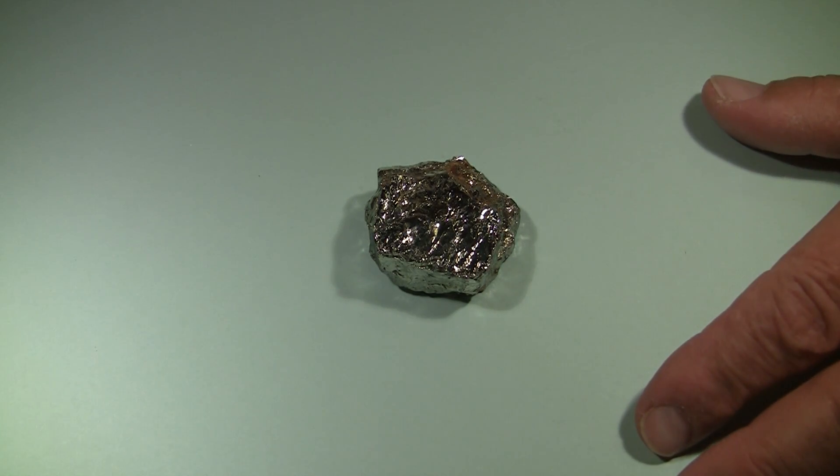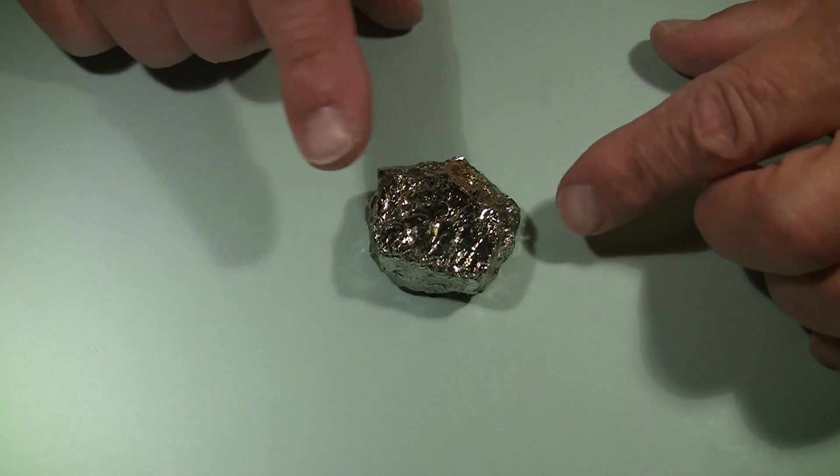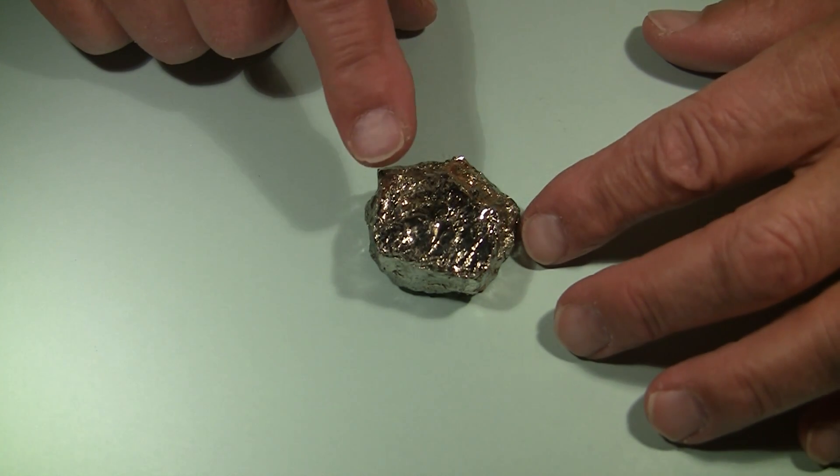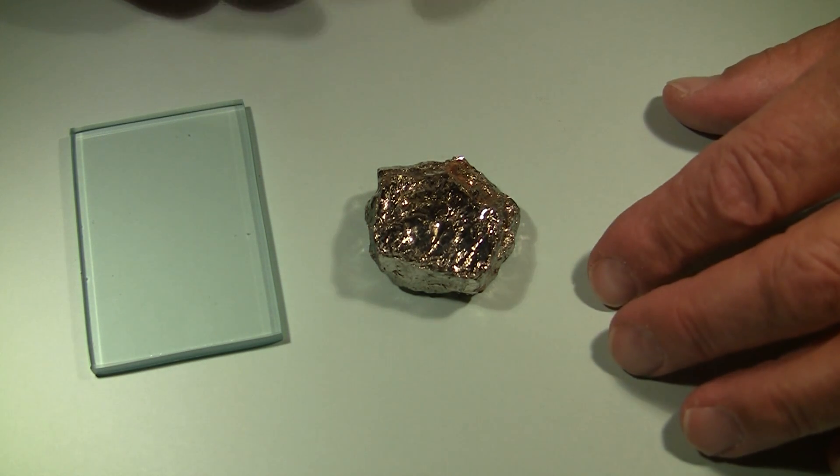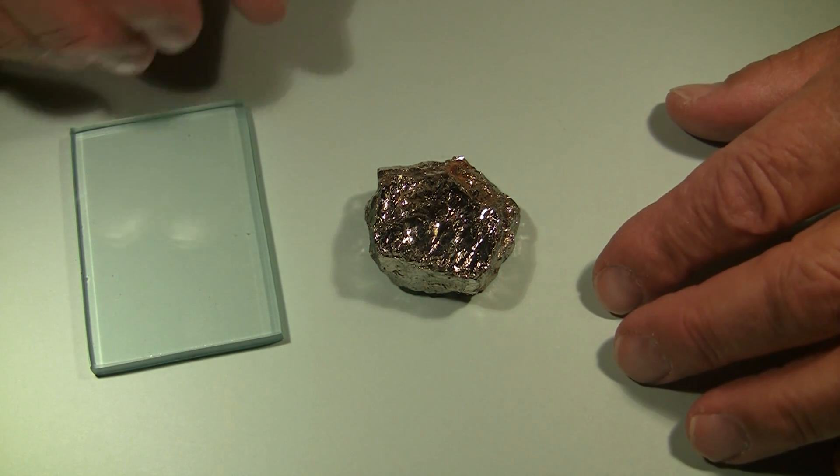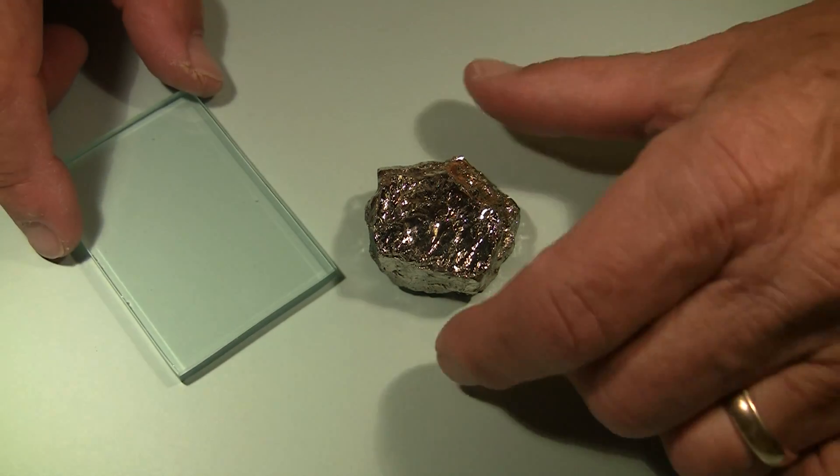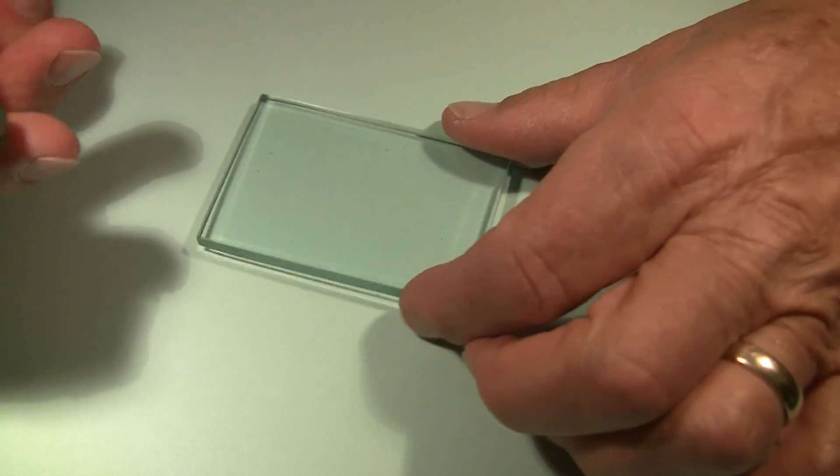This metallic mineral is either pyrite or chalcopyrite. Hardness of pyrite is 6.5 and should scratch a piece of glass. Hardness of chalcopyrite is only 3 and will not scratch glass. That seems like a pretty easy test to perform on this specimen. We've got the piece of glass here.